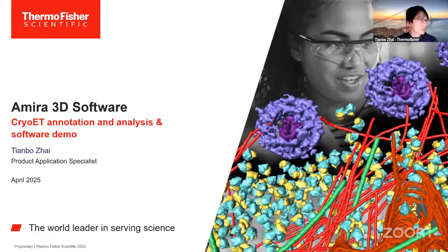Oh, okay. Thank you. So with that being said, today's presentation will be focusing on the AMIRA software. It's one of those image platforms that I consider a one-stop where you can transform your raw data into some meaningful statistics.